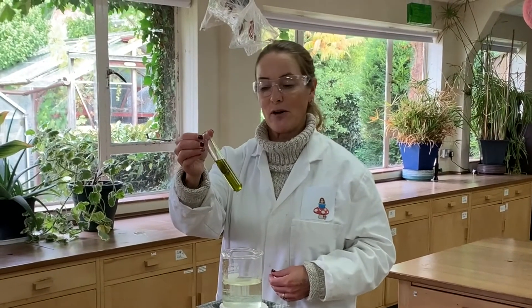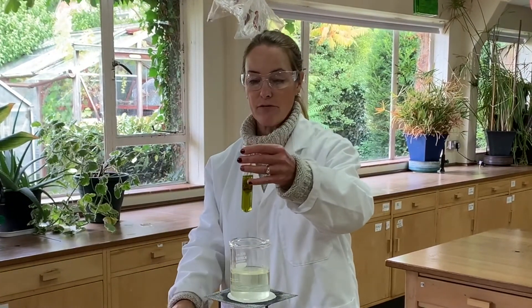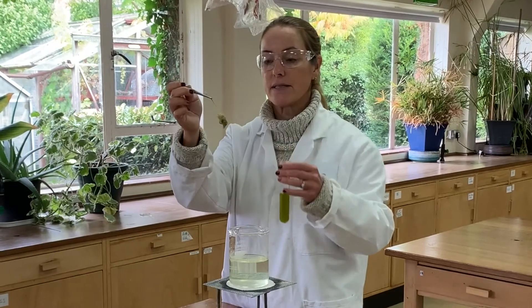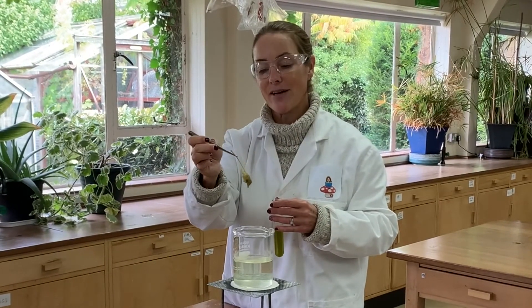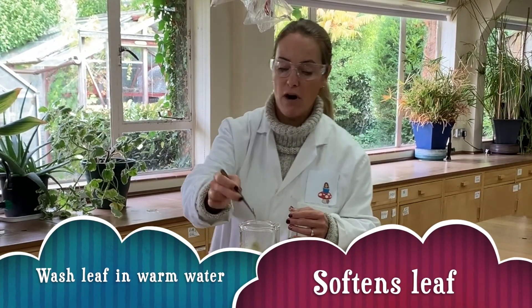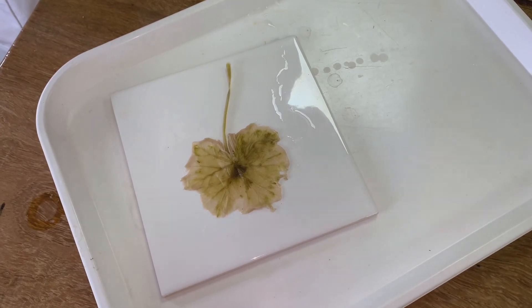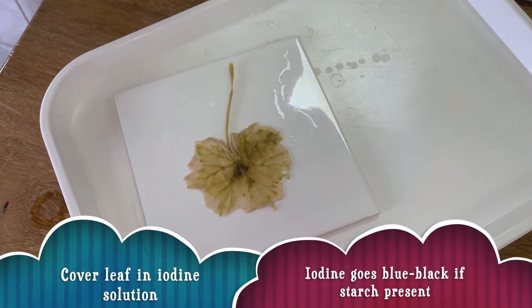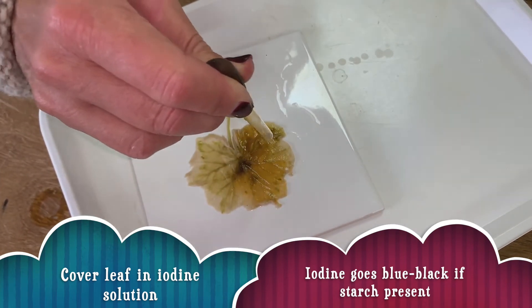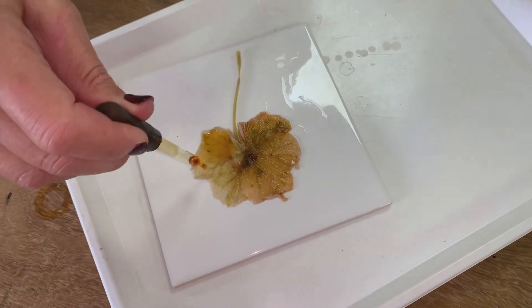As you can see, the ethanol has turned really rather green from all the chlorophyll it has removed, so I can now remove the leaf ready to test it with iodine. But the ethanol has made the leaf very brittle, so I can't spread it out yet to add the iodine — I need to wash it in warm water before I can spread it out on the tile. Now that the leaf is spread out, I'm ready to add some iodine solution. If starch is present you will get a blue-black colour, and we just have to leave the iodine to soak into the cells for a couple of minutes.